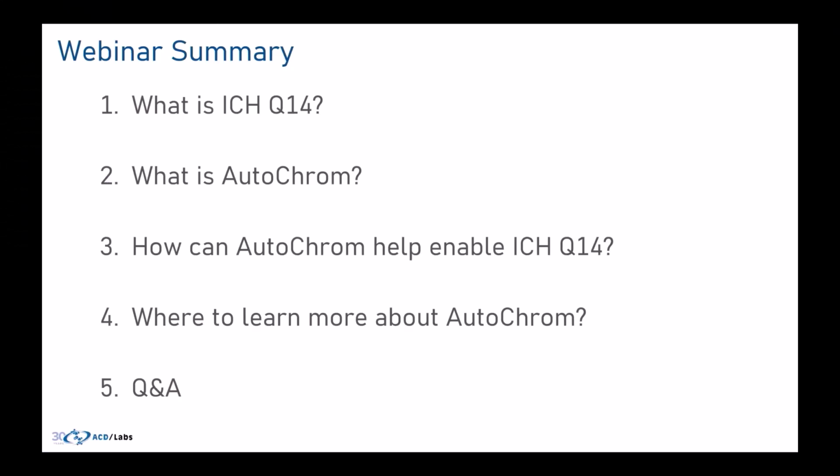Okay, so what are we going to cover today? What is ICH Q14? What is AutoChrom? And then how AutoChrom can actually help enable ICH Q14, where you can find more information, and then we'll have a Q&A session.